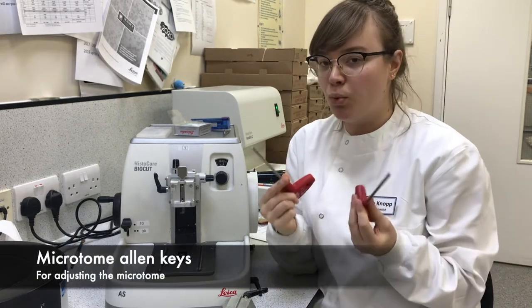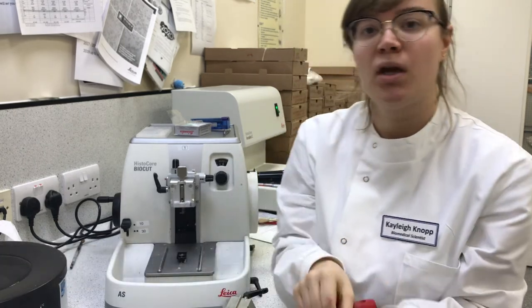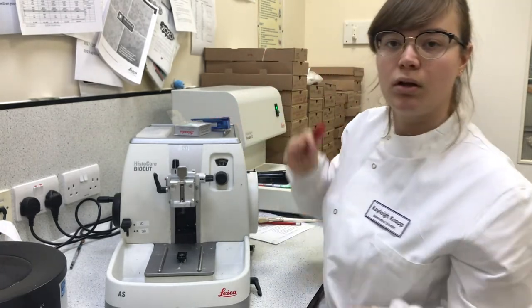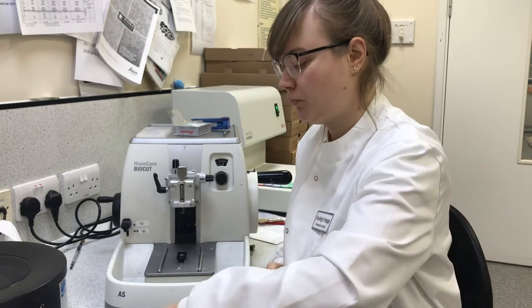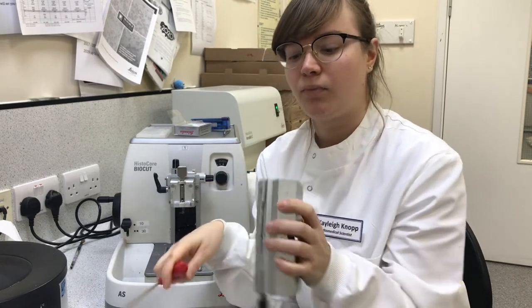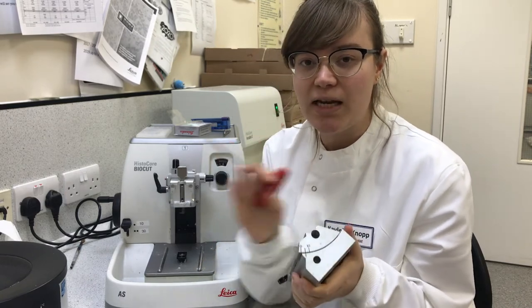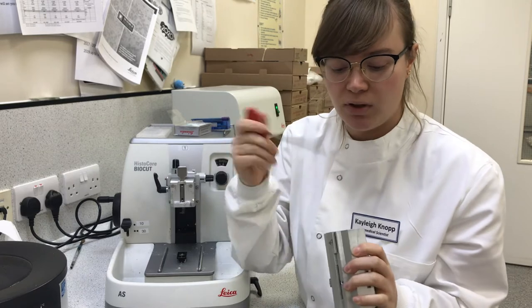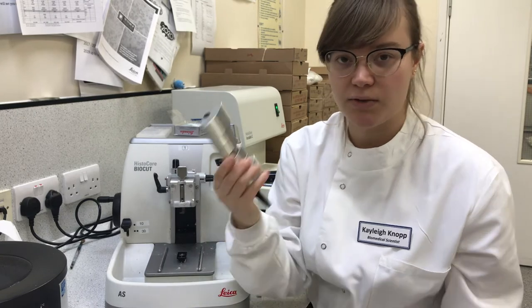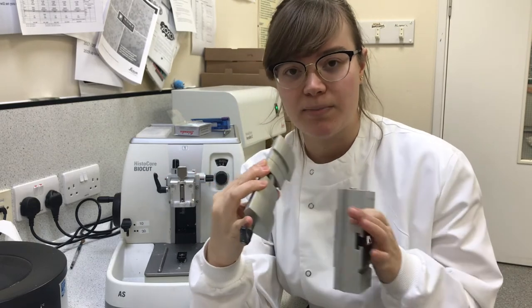With the microtome come two tools — this thinner tool and this other one, which is normally kept on a magnet behind your microtome. Insert the thinner tool on the opposite side to the lock where there will be a hole. To change the angle on this — which you're very unlikely to need — insert this, turn about half a turn, and this will slide off. You want to make sure that there's no wax buildup in any of these parts.